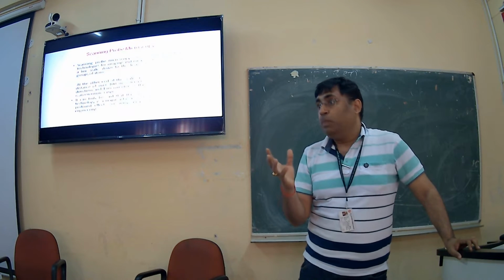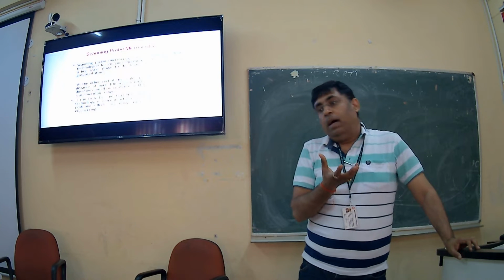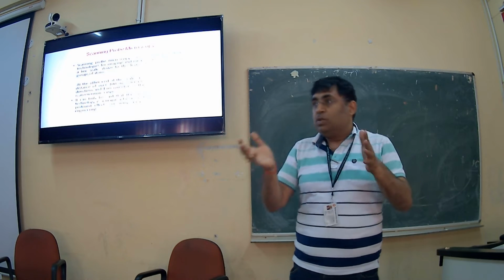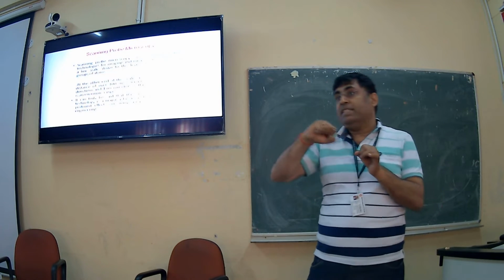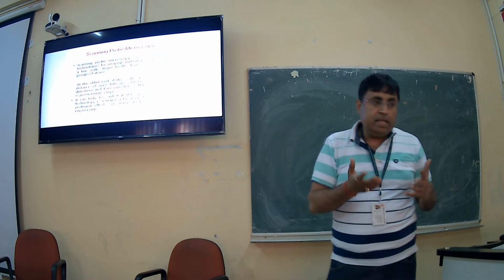It is spectroscopy, meaning this technique belongs to the electromagnetic spectrum phenomena. So this is entirely different. That's why it is named this way. It is a spectroscopy; the rest of the things were microscopy.